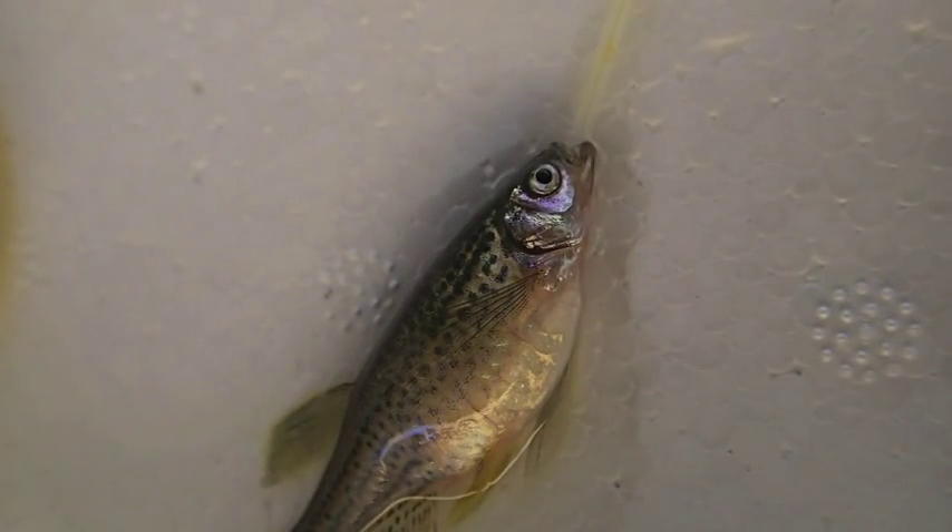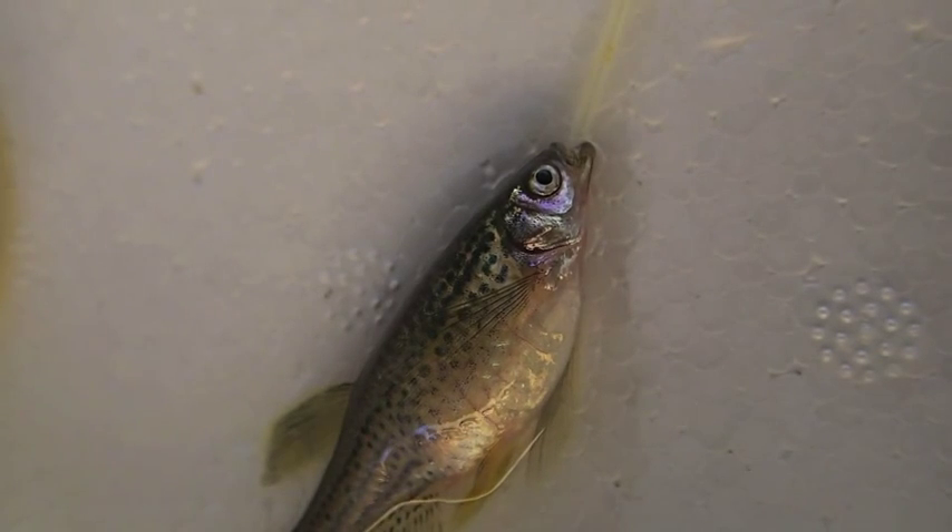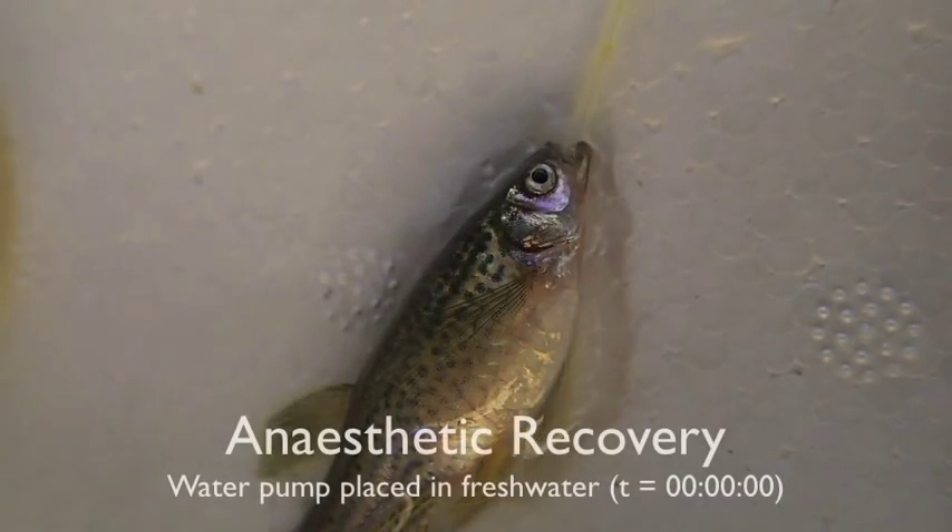Now we're more than 20 minutes into holding the fish at stage 4 anesthesia with MS-222 alone at a rate of 75 mg per litre. This demonstrates that you can maintain fish for quite a long time during your surgery or anything else for that matter.